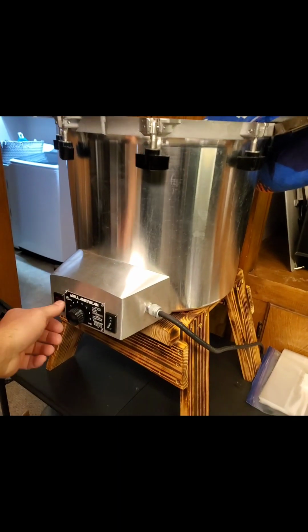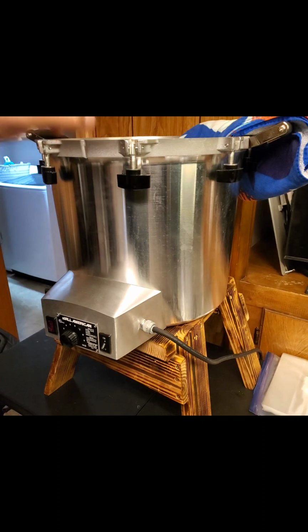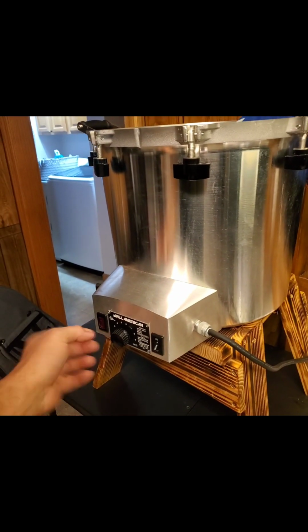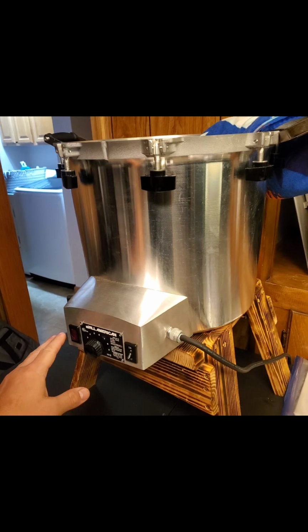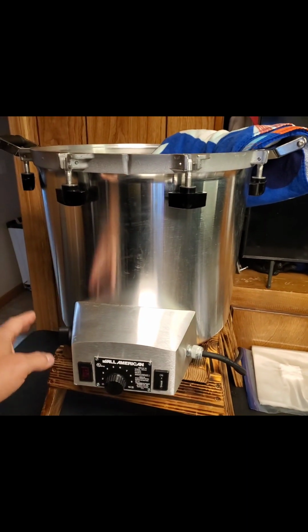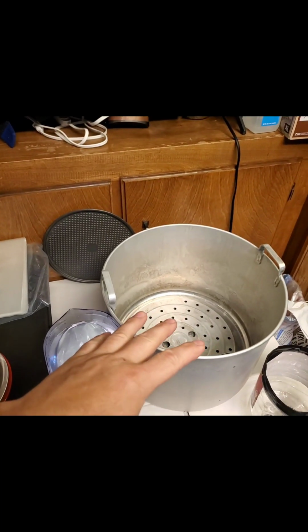Bring that to pressure. Put it on 10 until the steam starts coming out of the top. Let that come out for 5 minutes. And then we're going to turn it down to about 3.5. And that'll keep it between 15 and 17. That'll keep it rocking. Maybe even 4. Just depends. And we're going to cook that for 2.5 hours. And we'll have 6 bags of grain spawn by the time we're done with that.